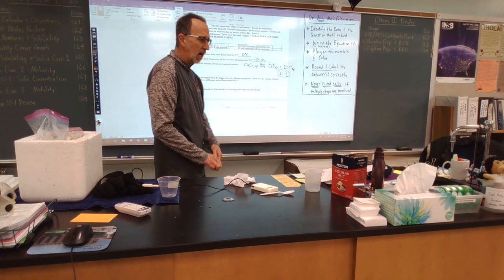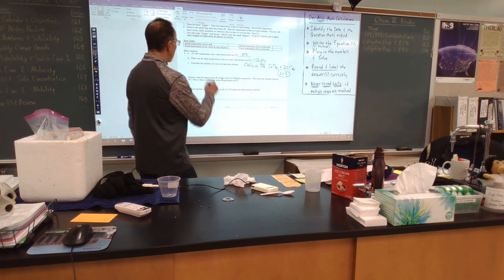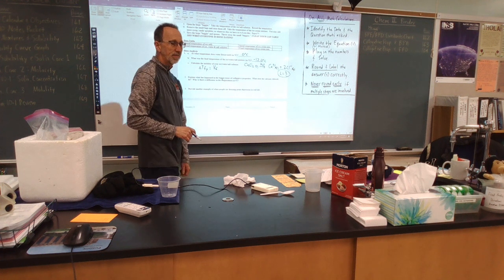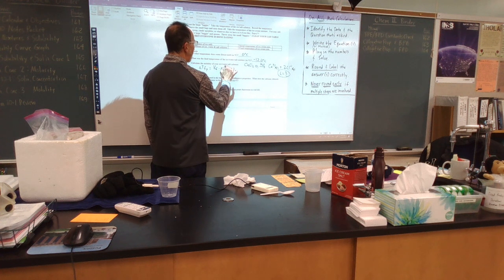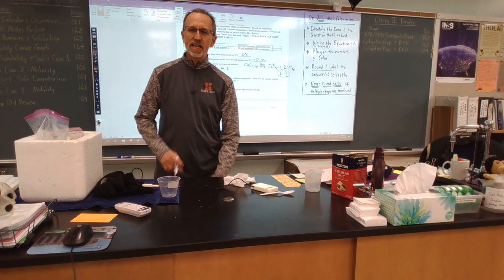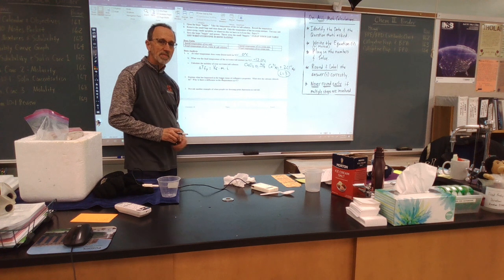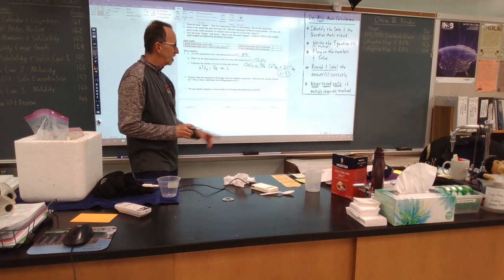So in calculating the molality of our ice and rock salt solution, the change in the freezing point temperature is equal to Kf, which is the freezing point constant for water, times the molality of the solution, times i. Again, if this was a non-electrolyte solute, then i would be equal to 1. We talked about that in our lecture, and so that would not play into this.